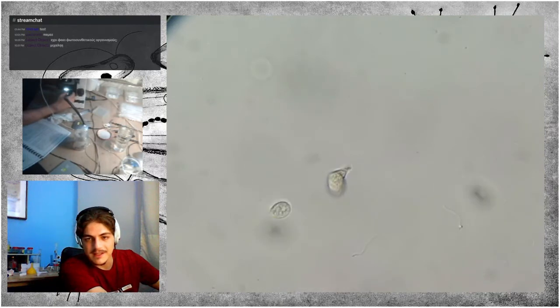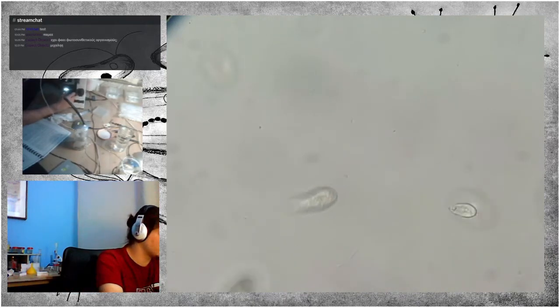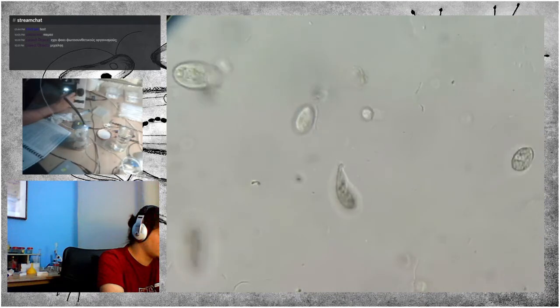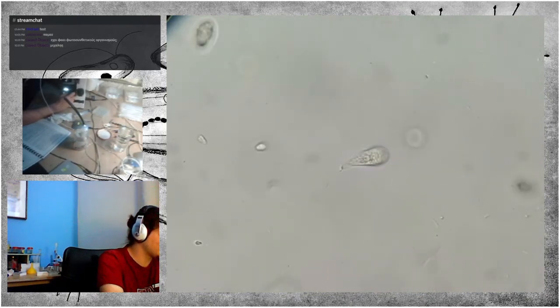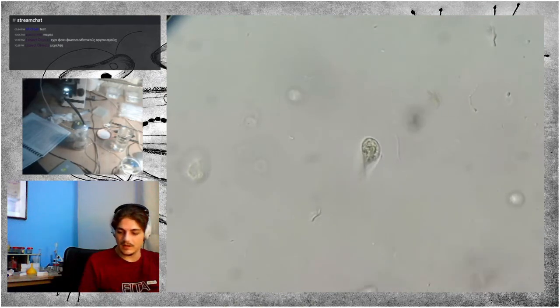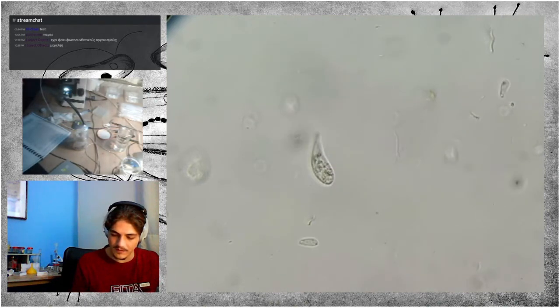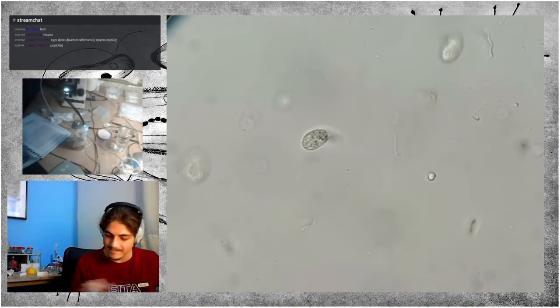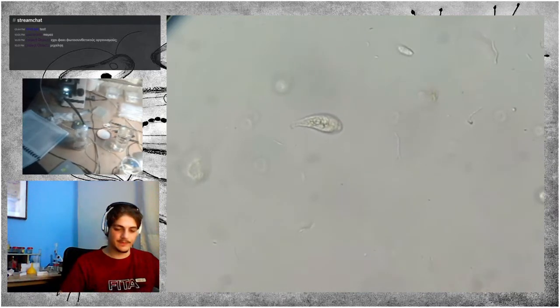I don't think you can see it. You can just about see the movement sometimes. It's quite subtle though. I don't think I've seen anything resembling that, and I don't think there is something like that in the book. Nope, unfortunately.